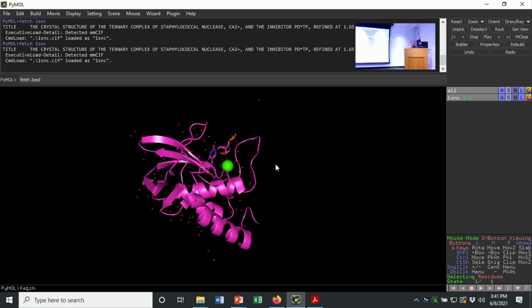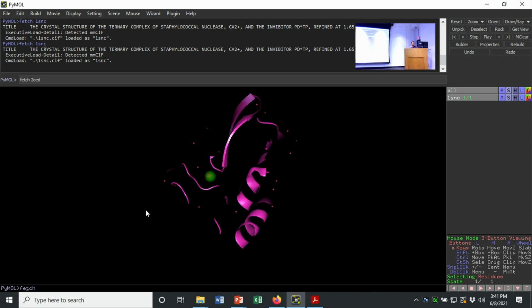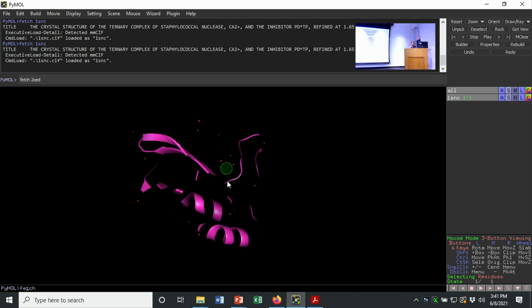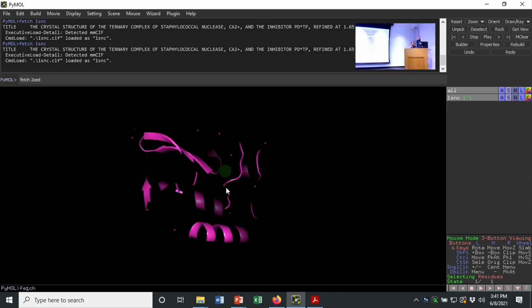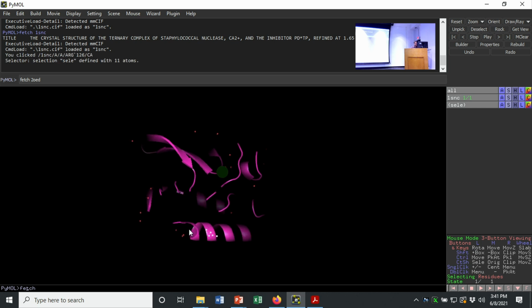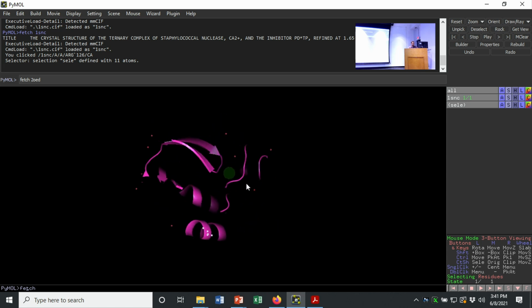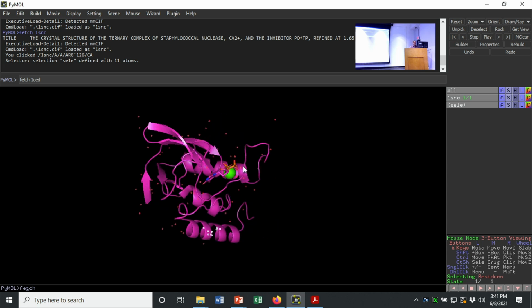So let's dial it back down again. If I dial my slab down so it's really small, now you can see I'm moving it, but only a tiny little fraction of the molecule is cut through. And you can see down here is where this helix is starting to intersect my slab, and I'm not seeing anything that's coming in front of that front plane. And so that's useful.